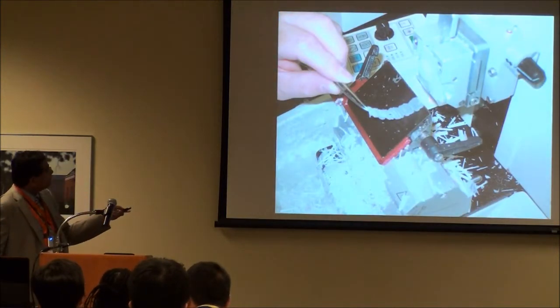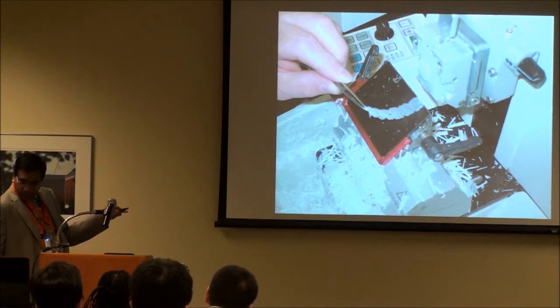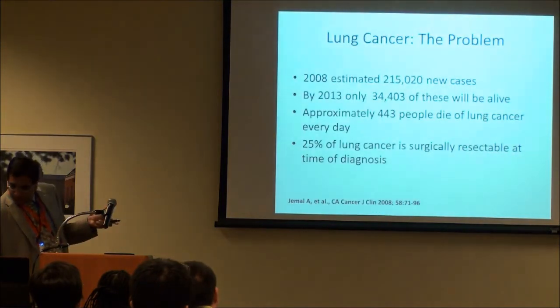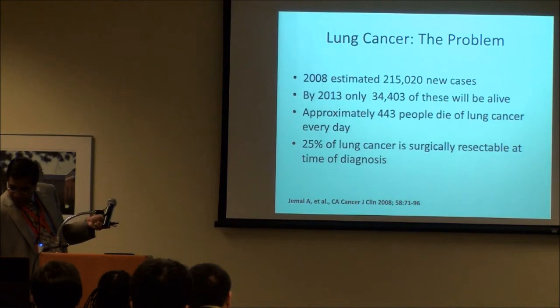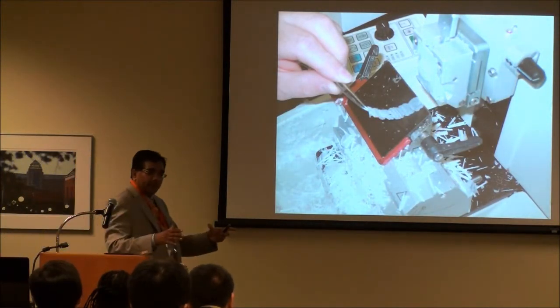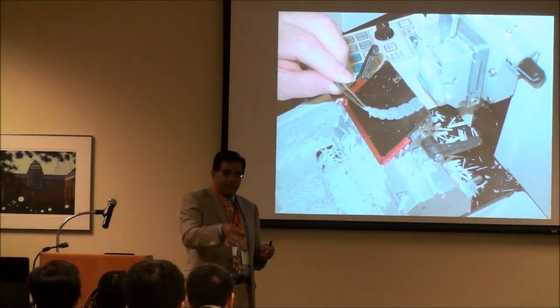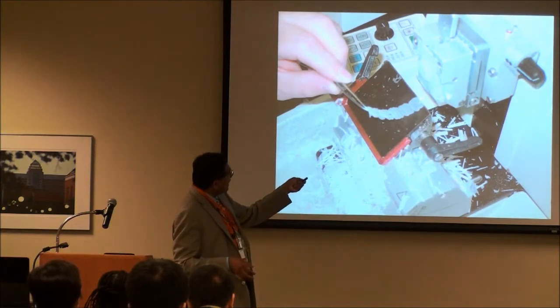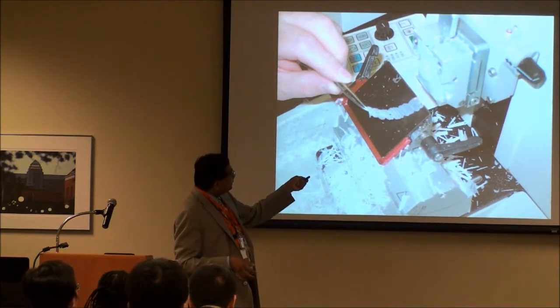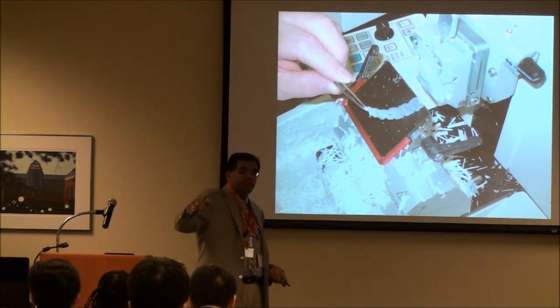Here is how the sections come out. As the sections come out, these are 3 microns. You can see the wax around it. Then what they do is put it onto a water bath and spread the tissue around, take a glass slide, take a section of this tissue onto the slide, and then dry it and stain it and give it to us.